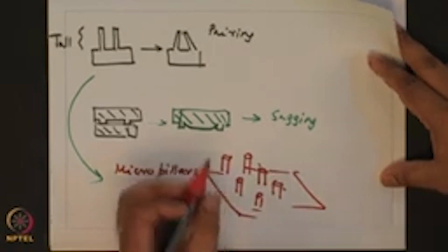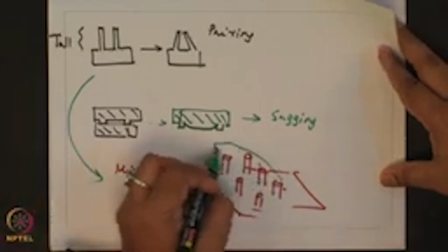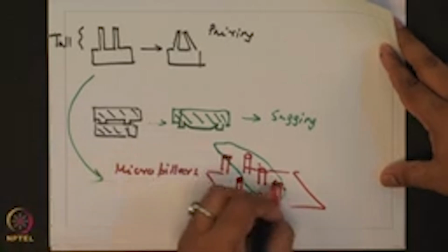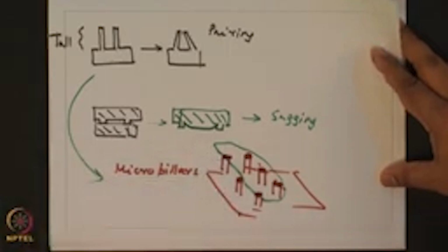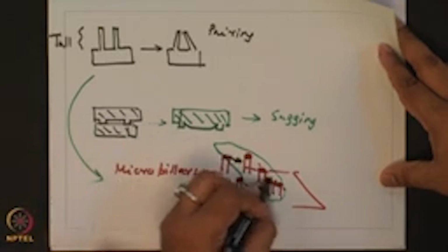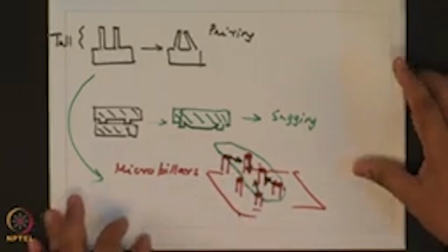Then you can plate a cell on top of this. If the top was coated with some ECM ligand, then the cell can actually spread and then exert forces. So, you will have a cell assembled on this and exerting forces which are directed inward.